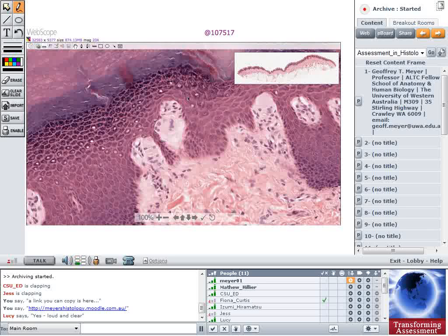And again, as I kept saying before, this has been an enormous cost saving for our school, particularly when we only had 50 microscopes to suit the 50 students we had a few years ago, compared to now 375. So they access their learning completely online.